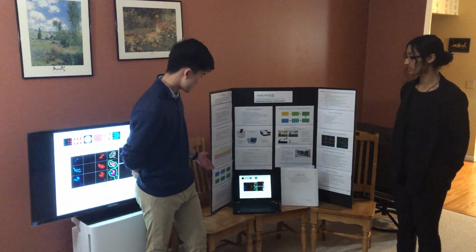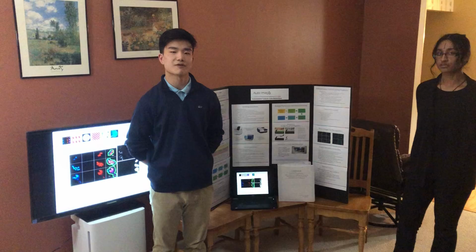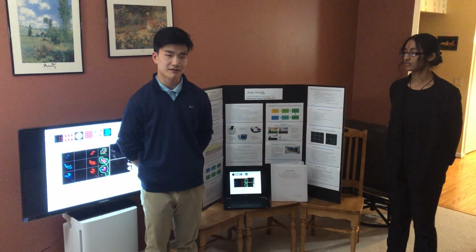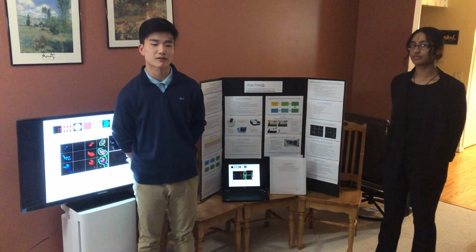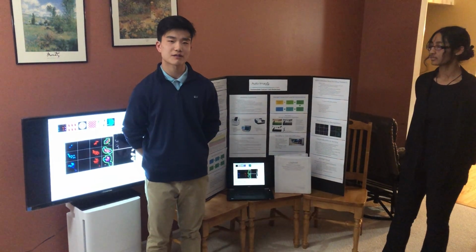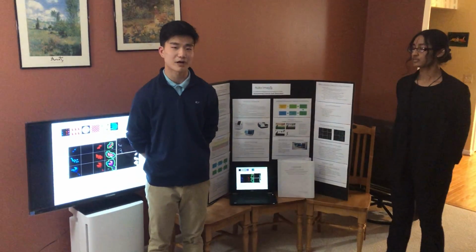So here we outlined the basic research process of immunofluorescent staining, and from here we learned that the process of counting these cells from a single scan can take anywhere from 5 to 7 hours, and so we wanted to attack this area. This led to our proposed solution of creating a program that automates much of the cell identification and counting process, that also provides an avenue for researchers to share data with each other, and that utilizes machine learning to make it more accurate.